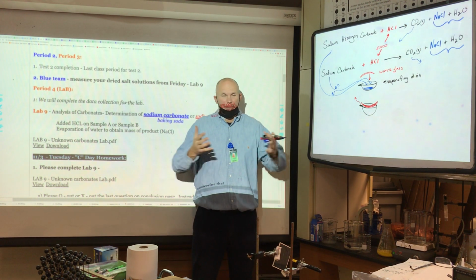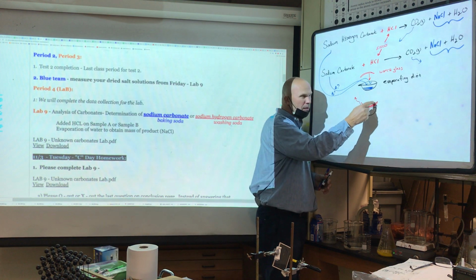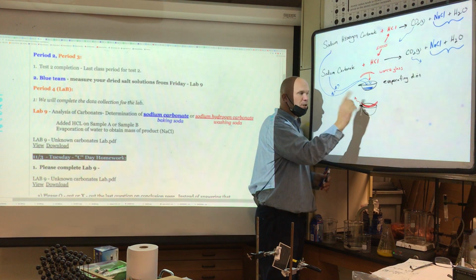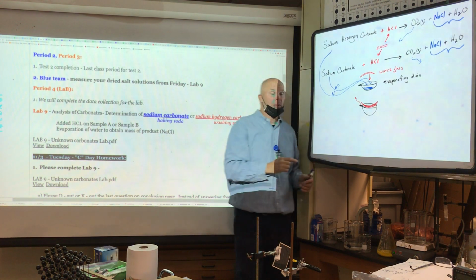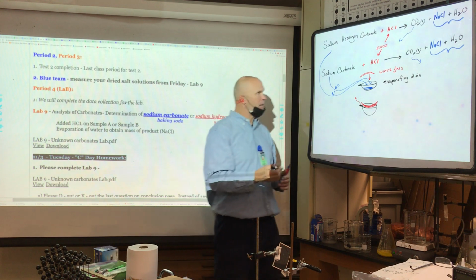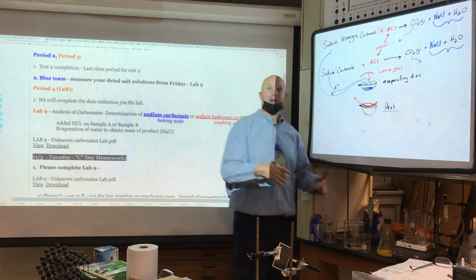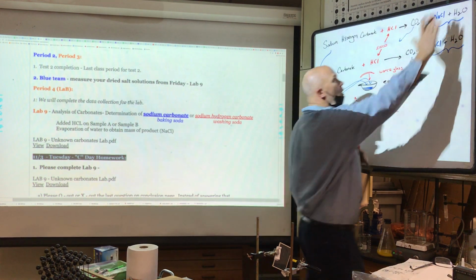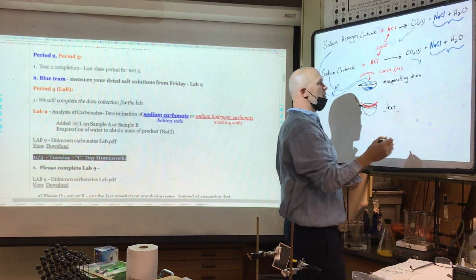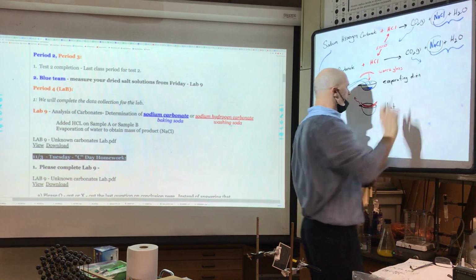The water is going to evaporate. There's going to be splattering of salt water. Eventually you're going to have salt on the top or the bottom of the watch glass, and of course inside the evaporating dish. Because it's called an evaporating dish, we're going to evaporate off the water and the excess hydrochloric acid to reclaim the dried NaCl. It's kind of cool.